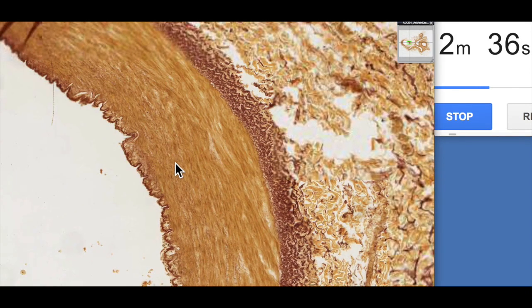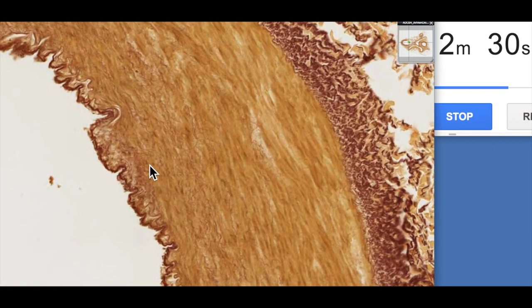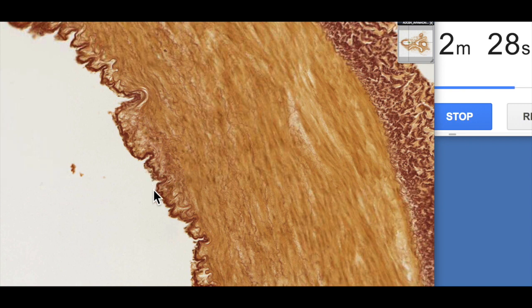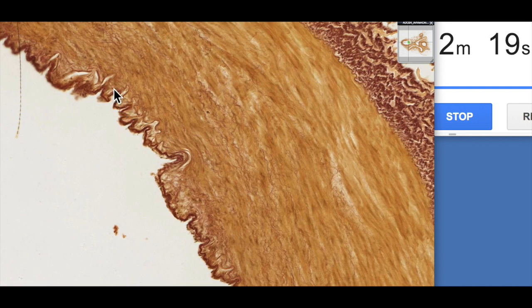Now this is using an Orsian stain, so we've highlighted elastic fibers. This is the tunica intima with a simple squamous lining. And this brown layer here, this is a single elastic lamellae or lamina, and this is known as the internal elastic lamellae.